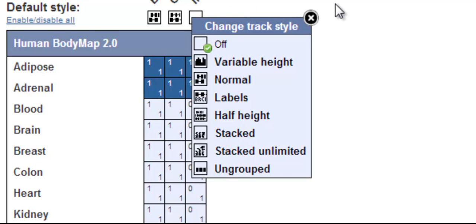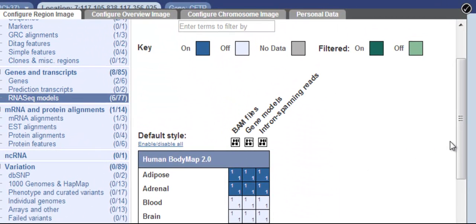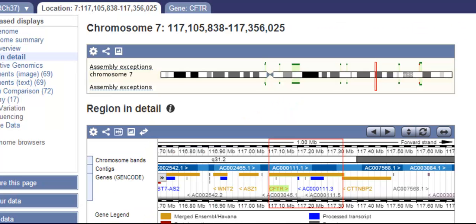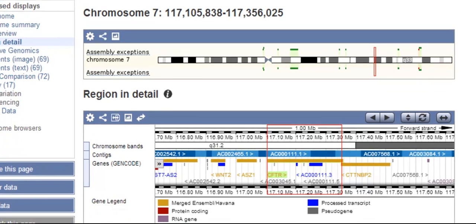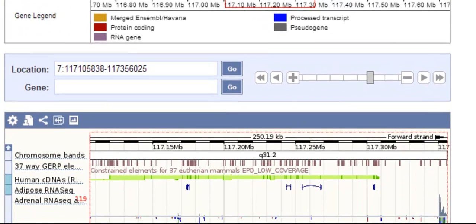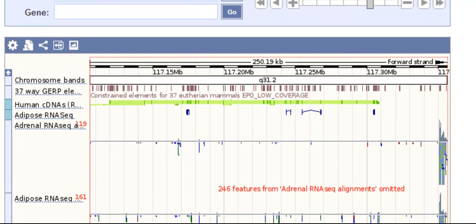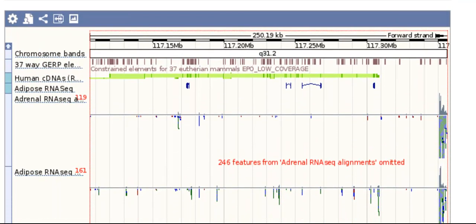Note cells that are turned on are dark blue. If a cell has a one or higher in the top left and is dark blue, it will be shown in the visual display region in detail. Click the tick or anywhere outside the panel to save the configuration and close the panel.